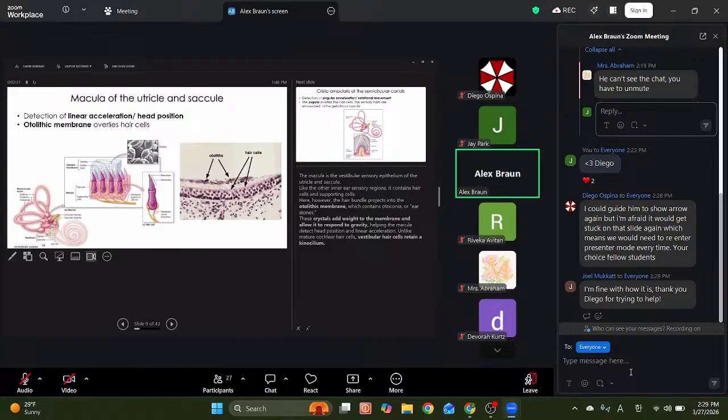Each of them has hair cells like this, which have upon them a tuft of hairs. A tuft of hairs actually consists of stereocilia. They're not really hairs, they're really stereocilia. And they're interesting because they're highly organized, like a series of steps. One row of stereocilia is taller than the row in front of it, and behind that is another row which is taller yet, and behind that another row taller yet. So altogether they have a step-like configuration going from relatively low to relatively high.